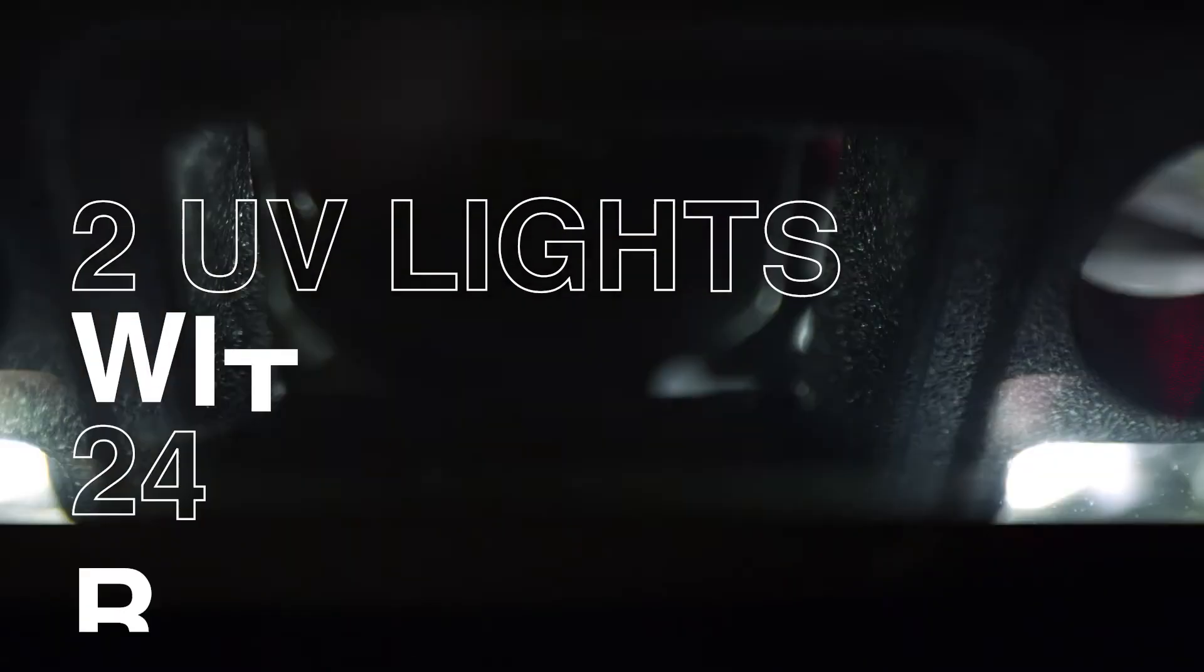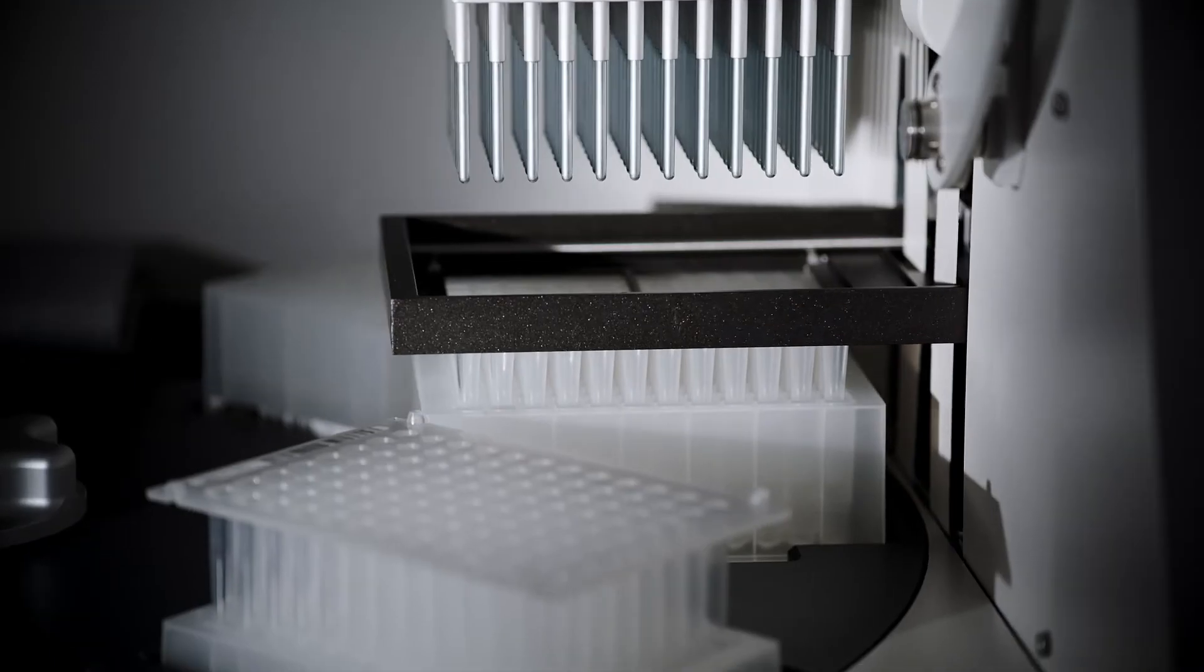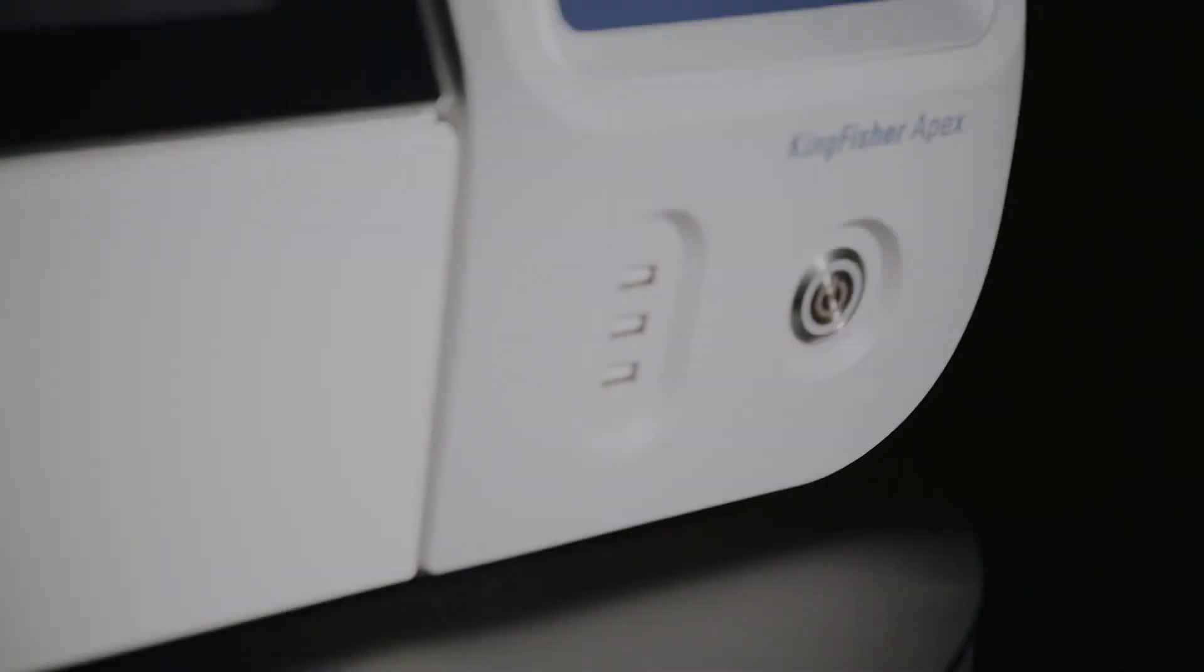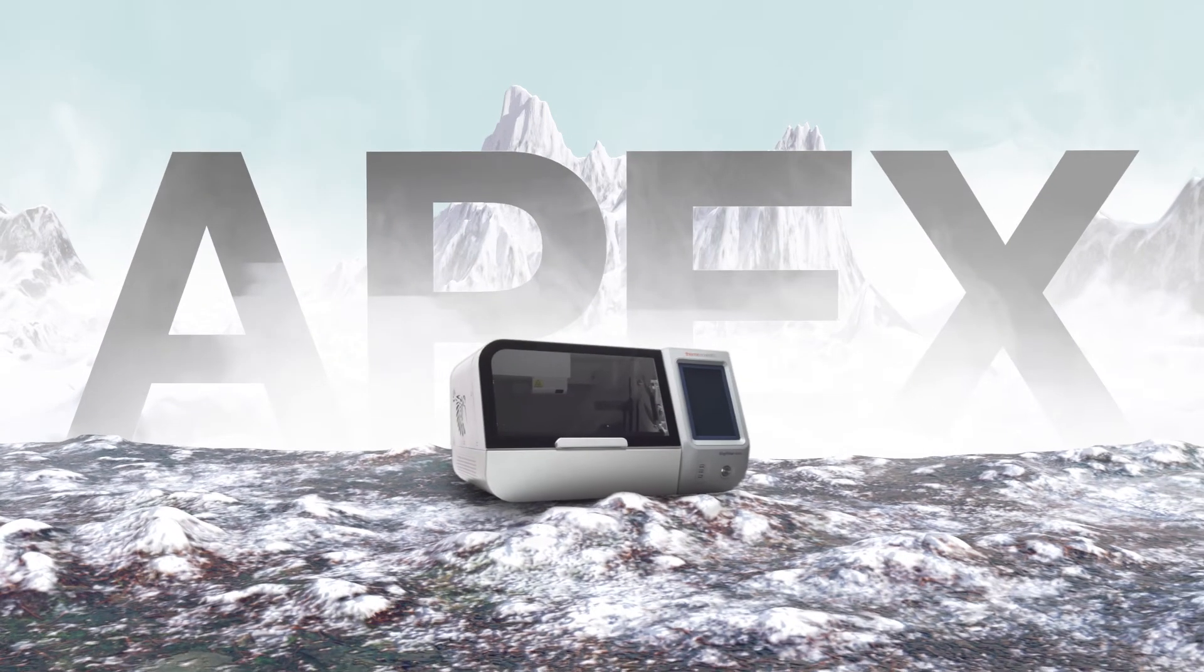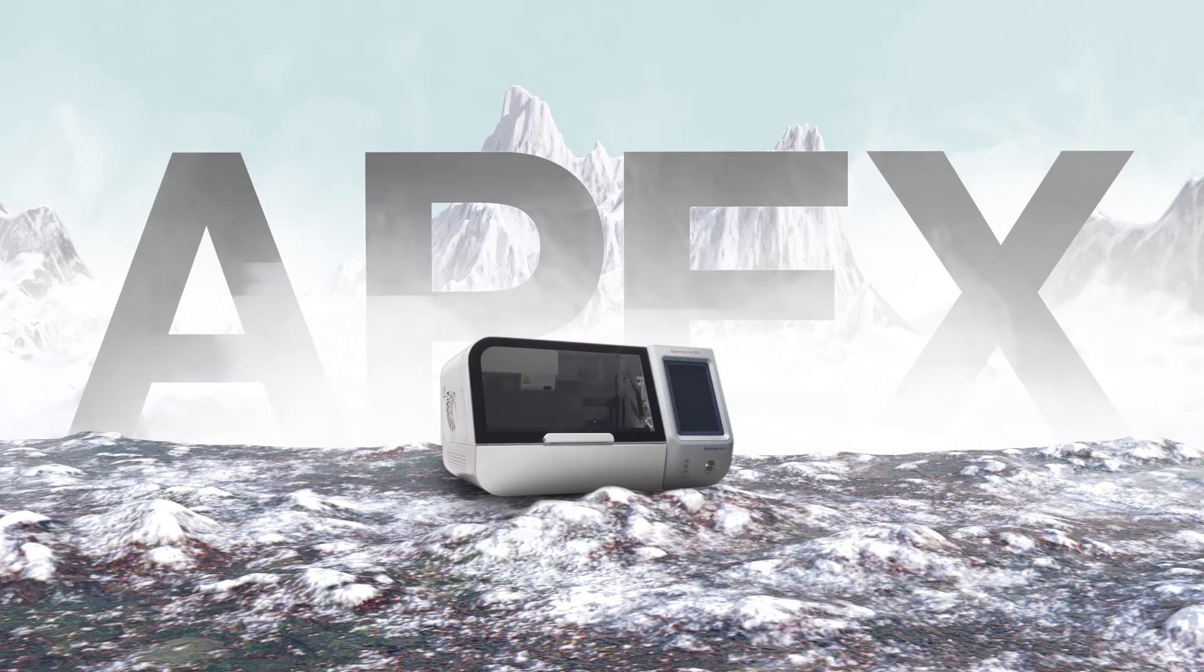Two UV lights safeguard against contamination. You'll be amazed by how much simpler prep can be. Ready for the APEX? Request a free Kingfisher Showcase in your lab.